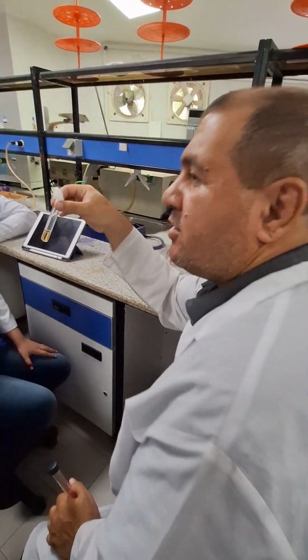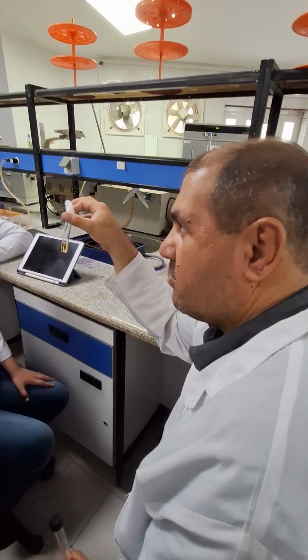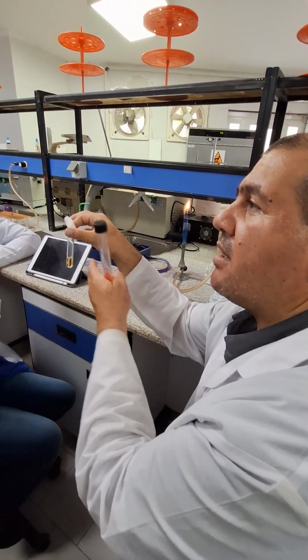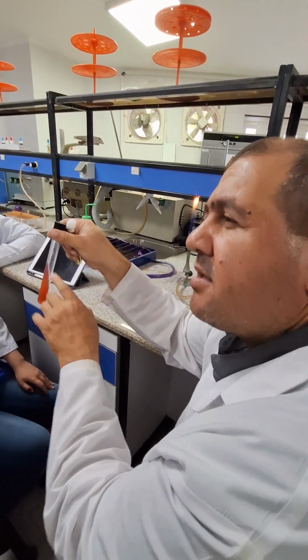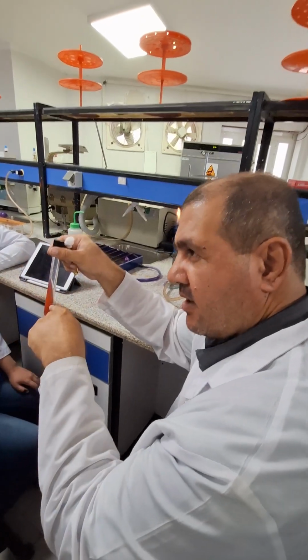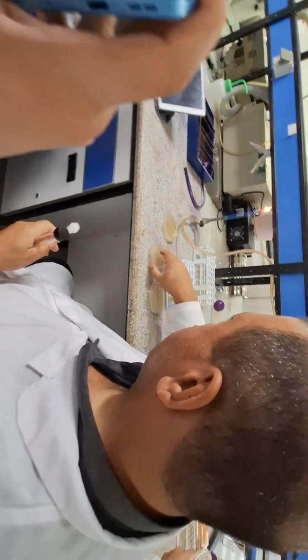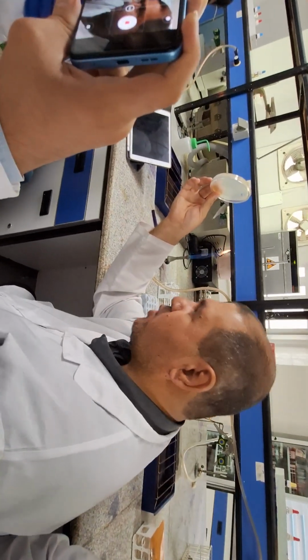This medium is a liquid medium or broth medium, broth, without agar. This contains agar, I think 1% of agar. Solid medium, this is in the plate, contains 2% of agar, 2 and more percent of agar. Okay?